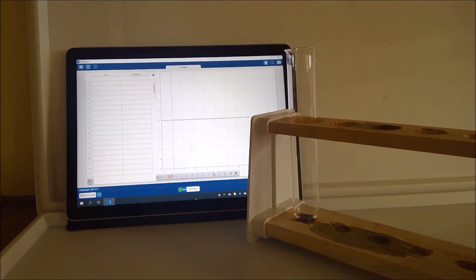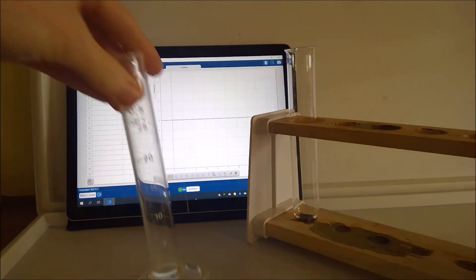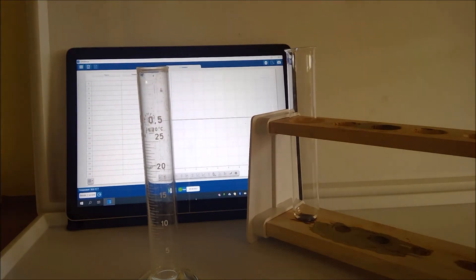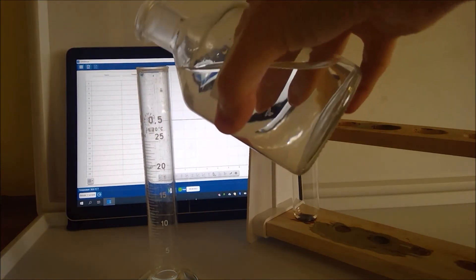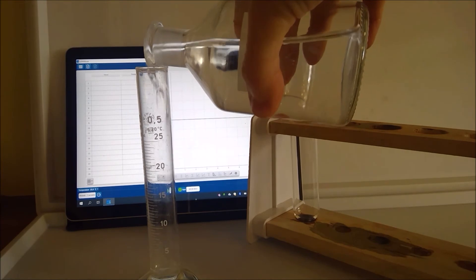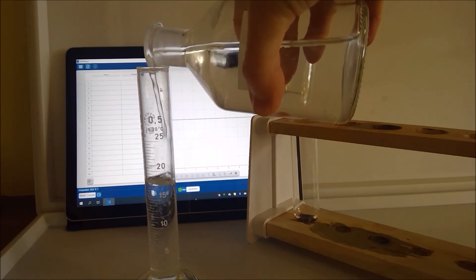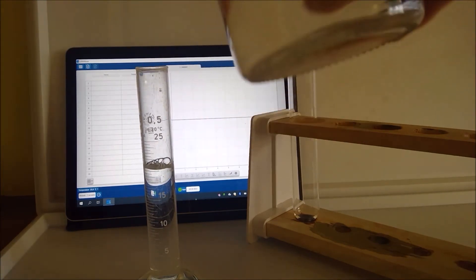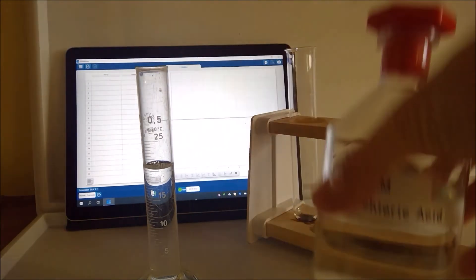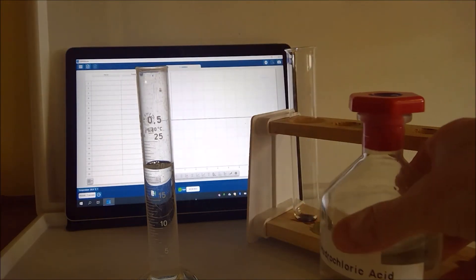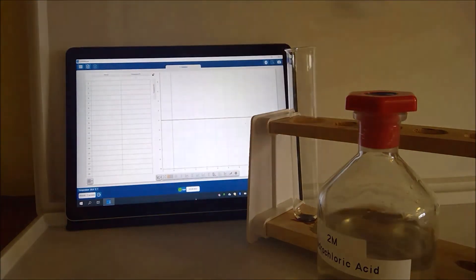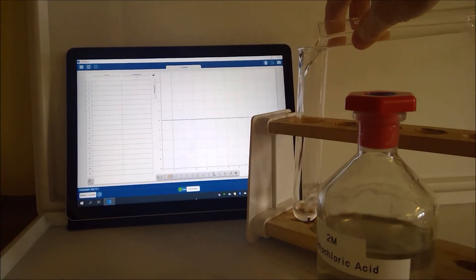In part B we're going to be reacting hydrochloric acid with magnesium so we're going to approach the experiment in a very similar way to we did in A. So to start with again we need 20 centimeters cubed of our hydrochloric acid so we're going to measure that out in a measuring cylinder. And that is on the line there so that was our hydrochloric acid there so we're going to pour that into our boiling tube.